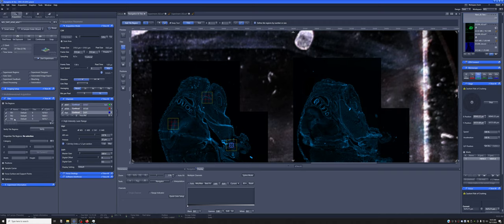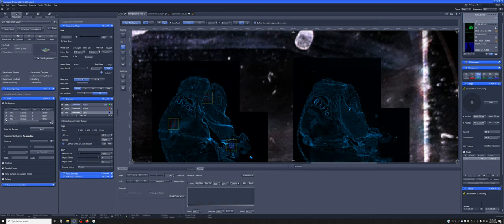So now if I say start experiment, the software will do whatever is on this list. I can keep things in the list and tell the software to not do certain ones. For example, I can say, you know what, don't do that third one. Just do the first two. But I will keep it for later if I need it. So I'm just going to do that. I'll hit start experiment.